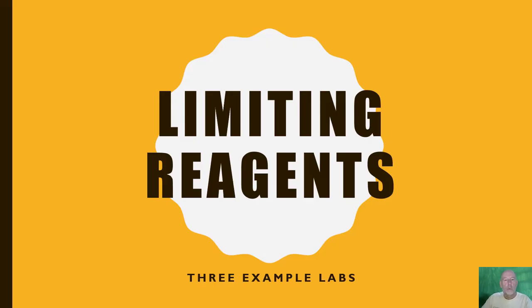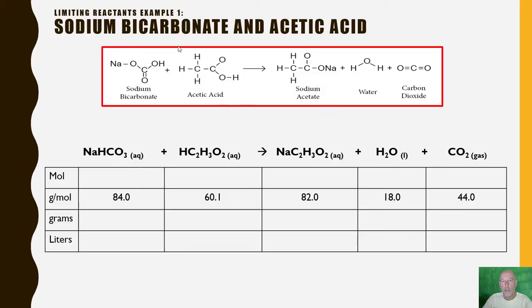Hi everybody. Today we'll be looking at three different limiting reagent example labs. The first one is going to be sodium bicarbonate and acetic acid. Now those are both aqueous compounds. In other words, they dissolve in water.